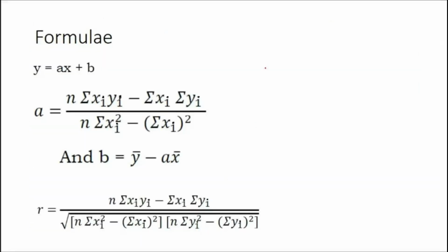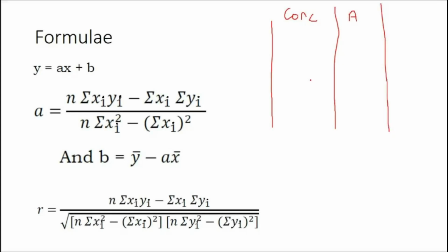Now, students, please remember what we are doing till now is we have different values of concentration and different values of absorbances.